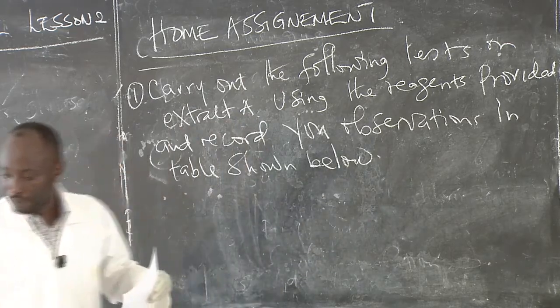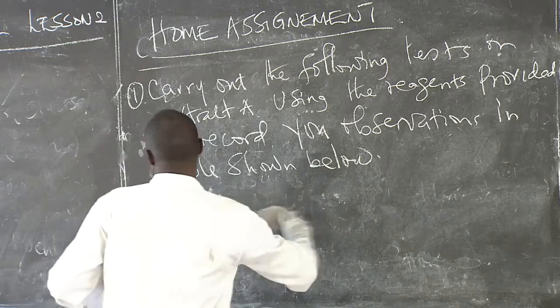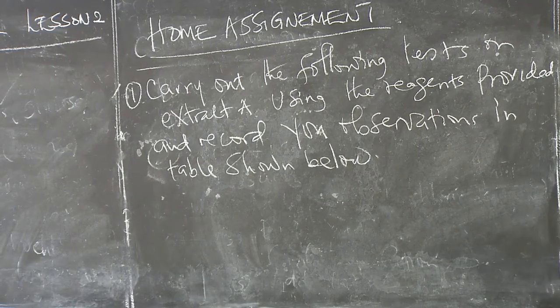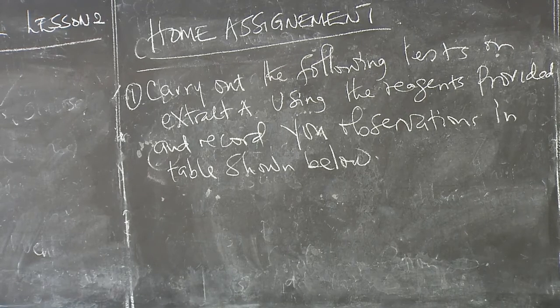So let us have the table, and we discuss briefly what we're going to be doing in that table.